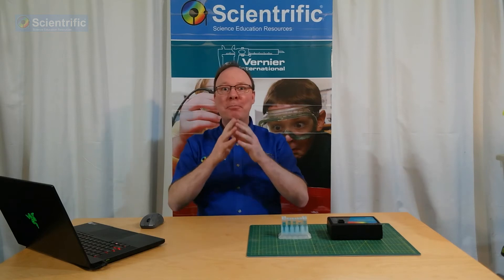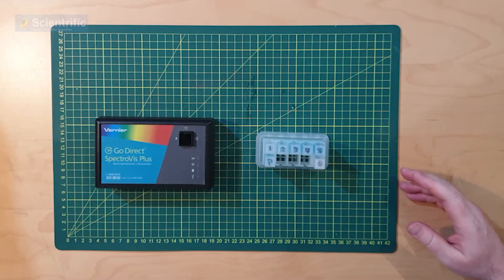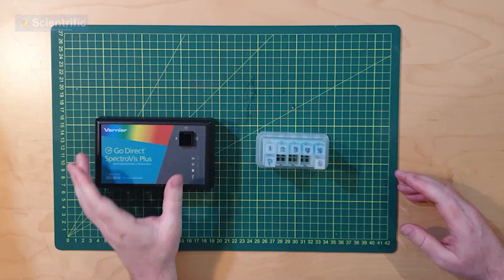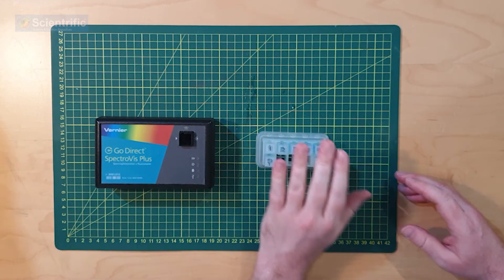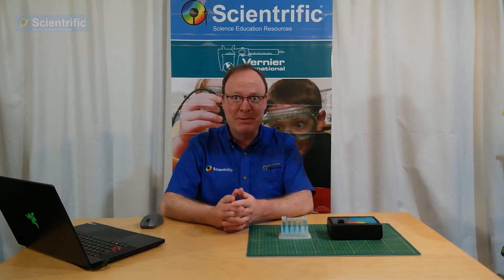Hello. With this workshop, we're going to be looking at something different again. We're going to be looking at Beer's Law, which is one of my favorites. We're going to be using the GoDirect Spectral Photometer. I have my cuvette with standards set up already. I have a new bit of software which is quite good — it's called Spectral Analysis by Vernier.